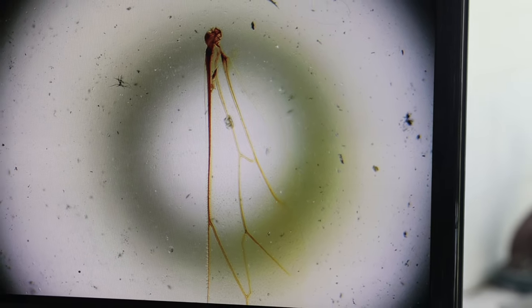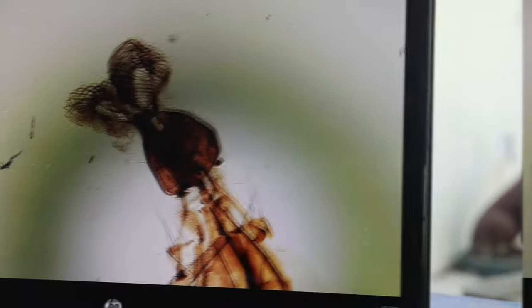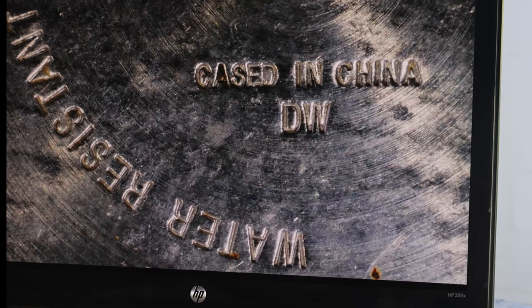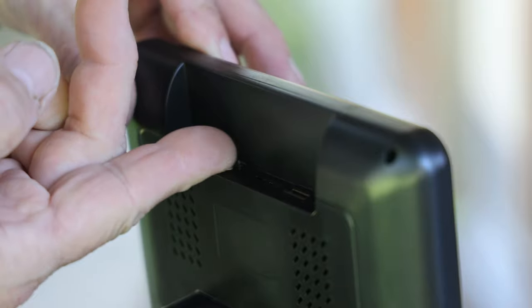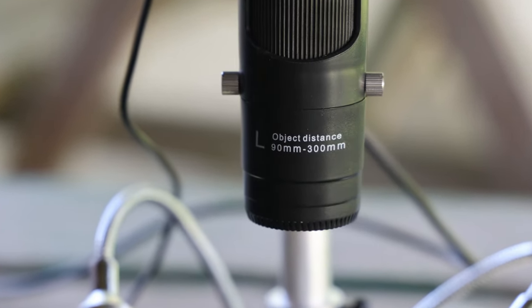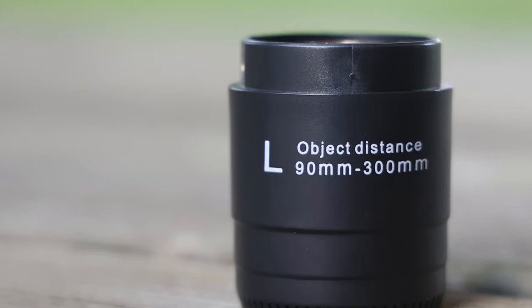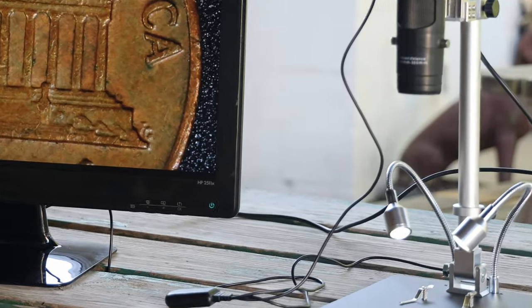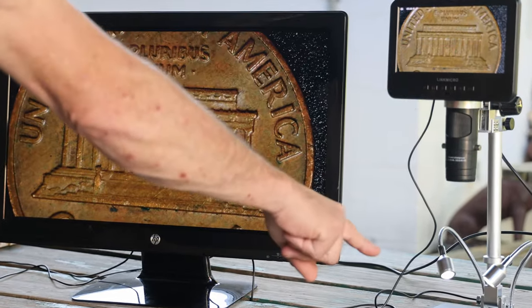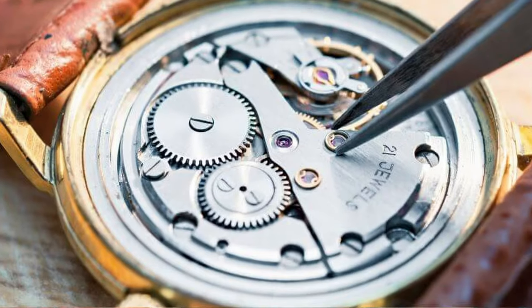I was going to view many different items for the test, but it's a microscope — it views things up close, we all know what they do. So in the interest of not making this video last forever, I'll just do one or two items with each individual lens. I'll point out any issues or things I like or don't like as I encounter them. The first lens we're going to test is the 90-300mm, or the L lens, which is the one you can view things from the furthest away. This extra space gives you an advantage to work on things where you need to see up close, such as soldering and watch repairs.